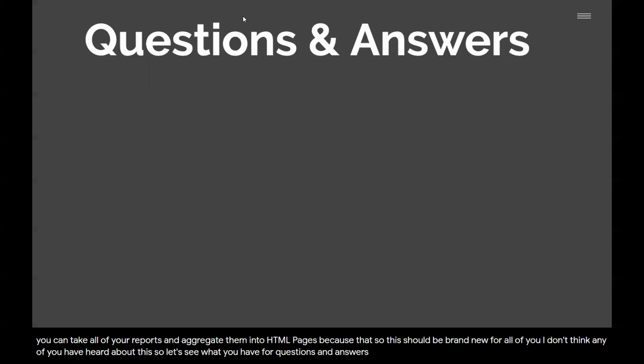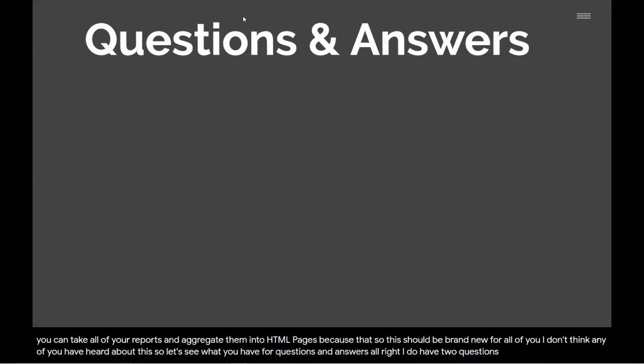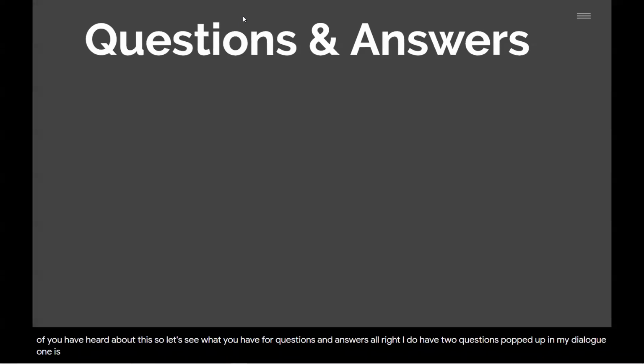All right, I do have 2 questions popped up in my dialogue. One is, can you put the captions back on? So sorry, those went away. They're done.